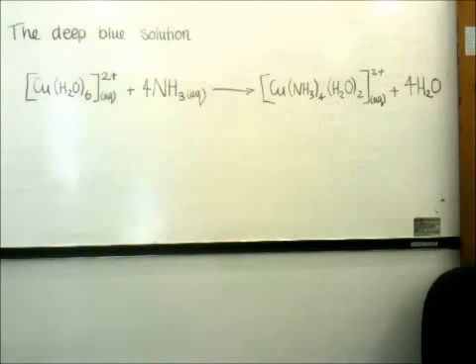The next observation was from a pale blue precipitate to a deep blue solution. The first ligand substitution occurs when 4 ammonia ligands substitute 4 water ligands in this reaction.